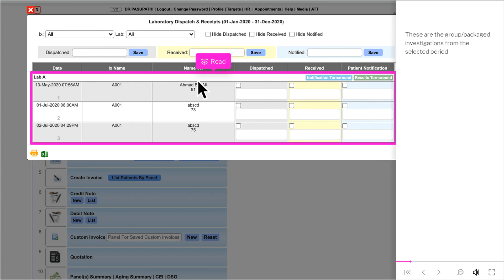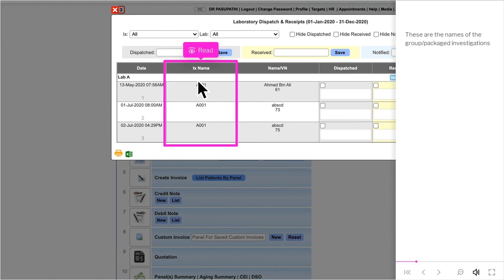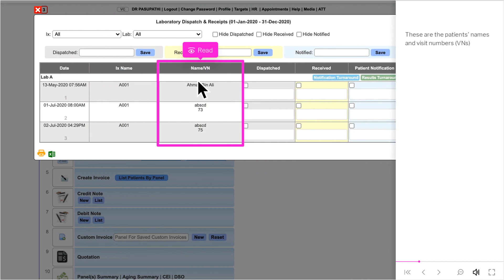These are the group or packaged investigations from the selected period, grouped by laboratory. These are the names of the group or packaged investigations, along with the patients' names and visit numbers.